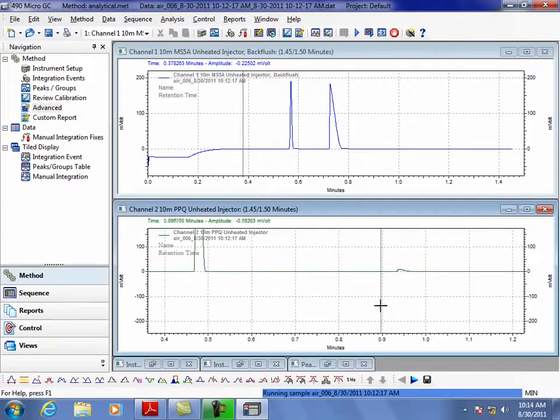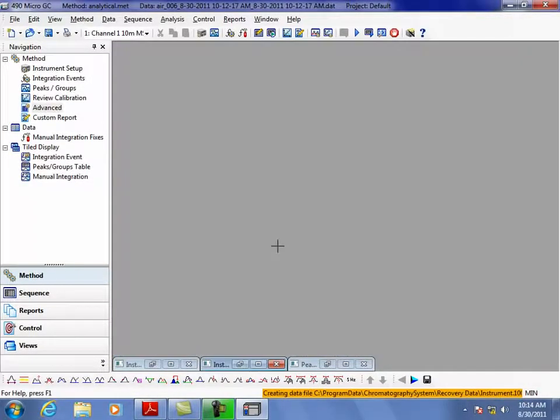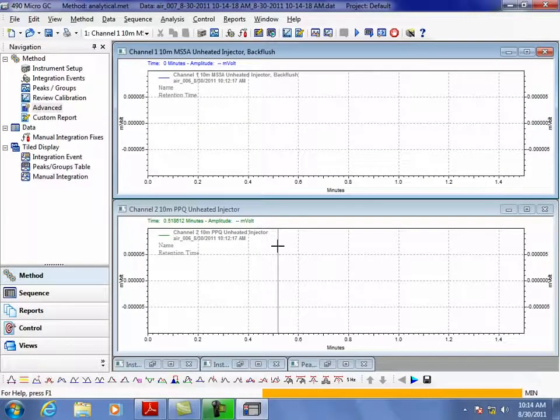This one still has that water out there. So the humidity is fairly reproducible in the room, but we have no water. Gas chromatography is not a really good way to do water. Why? It's hard to get a water standard. It's very, very hard to get a water that you know is reproducible in a gas, because even a change of 2 or 3 degrees temperature means now it plates out and dews out. The vapor pressure is just not high enough to keep it in a gas.